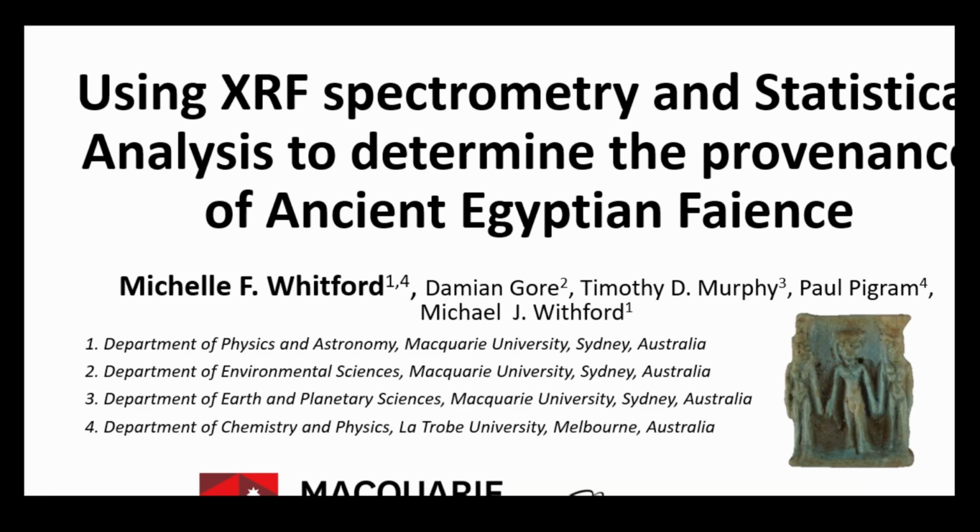Today I'd like to talk to you about X-ray fluorescence spectrometry and how we can use statistical analysis to determine provenance in ancient Egyptian faience.